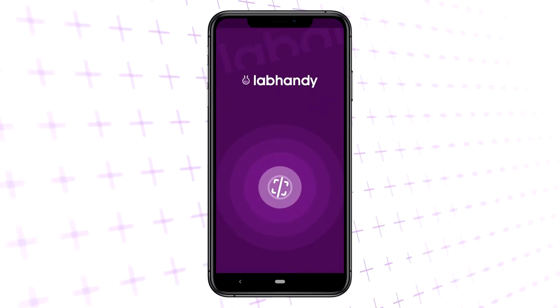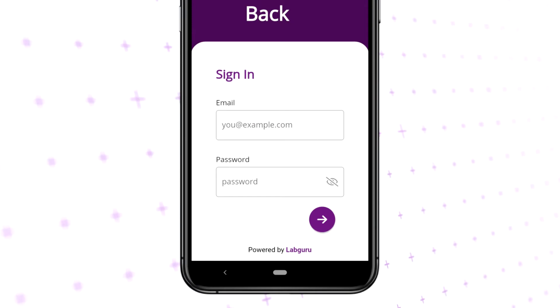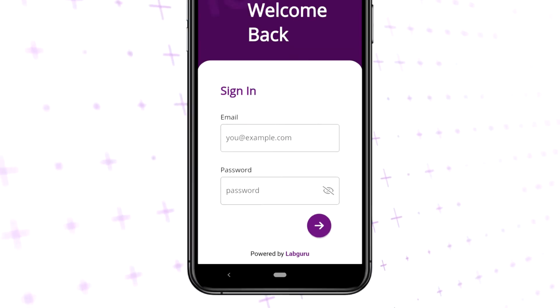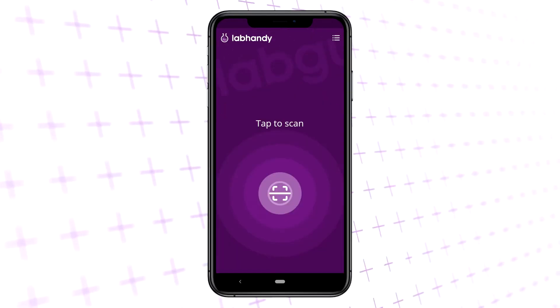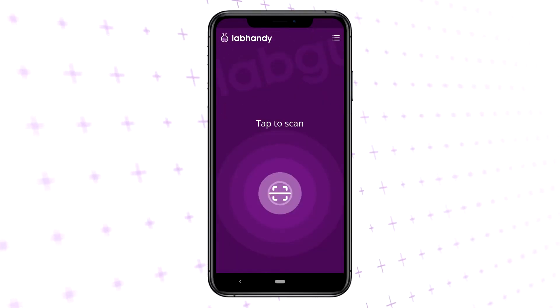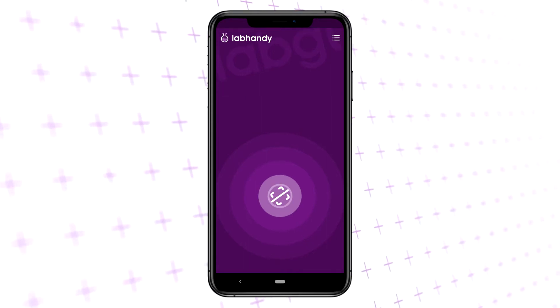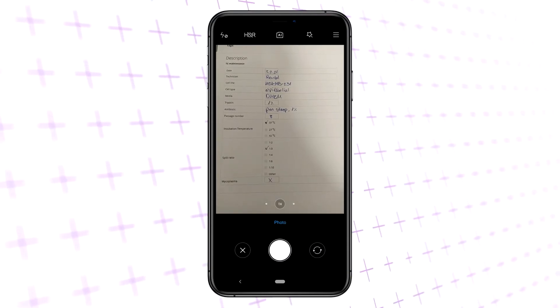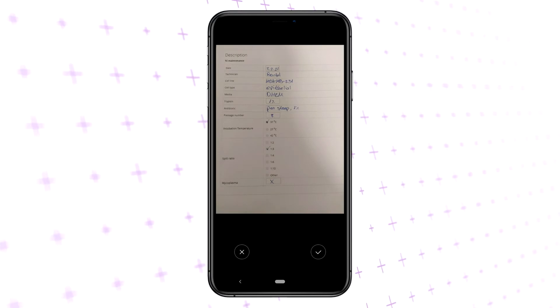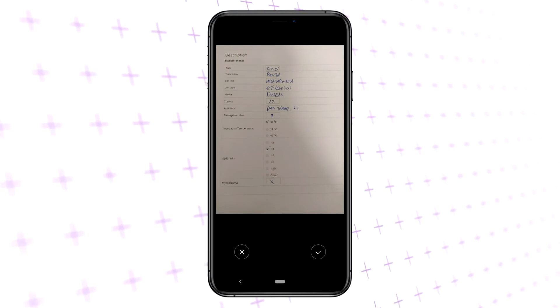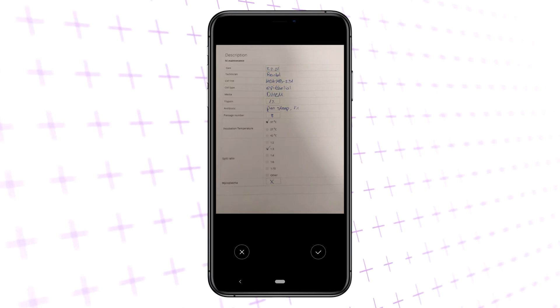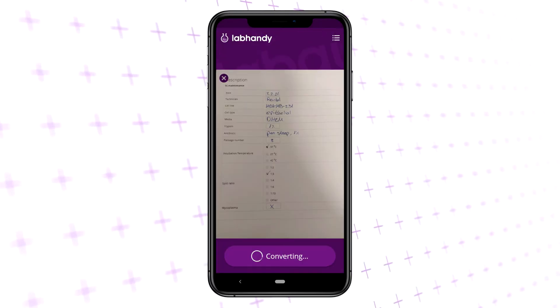After completing your experiment, log in to LabHandy using your LabGuru credentials. Once you are in, start the process by tapping the button to scan the table you filled while working on the bench. Take an image of your table, and check that all the information you need is fully captured and in focus. Approve the image to proceed.